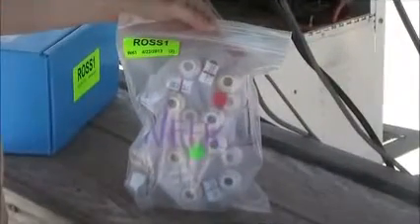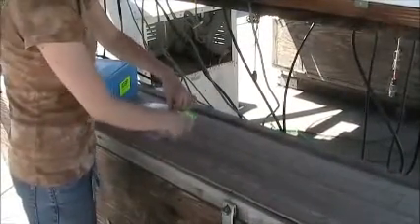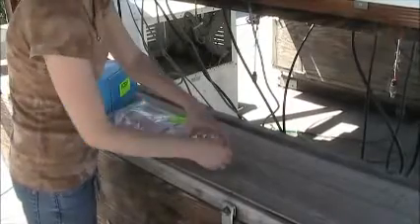Each blue box contains a flashcard and 3 weeks worth of filters. There are 3 bags in each box, 1 for each week. Each bag in a typical blue box contains a log sheet and 4 cartridges. The week 1 bag will contain the flashcard. Note that sites with an X module will have 3 additional bags with 1 cartridge and 1 log sheet in each.